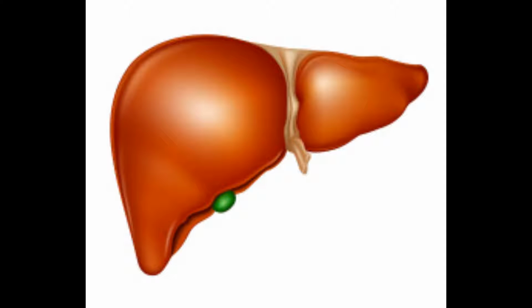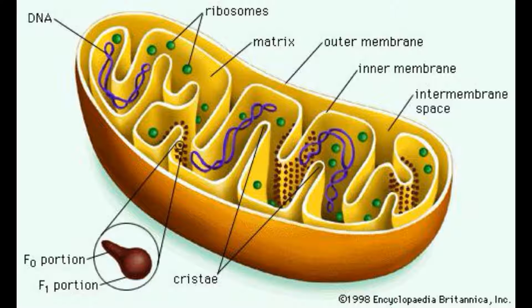The significance of this lab is to mimic a realistic reaction between the human liver and the mitochondria. The mitochondria releases hydrogen peroxide, which is toxic to the human body. So the liver decomposes it into water and oxygen, which is safer for your body to process. The lab was also executed to show how certain substances such as Tylenol and ethanol can slow down the catalyzation process of hydrogen peroxide in the liver.